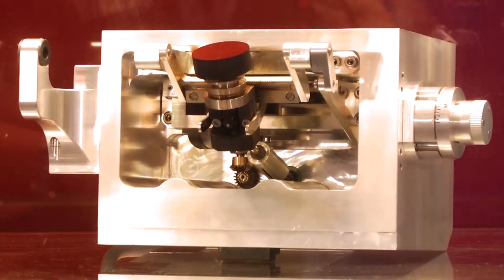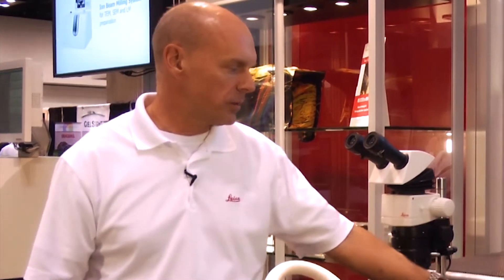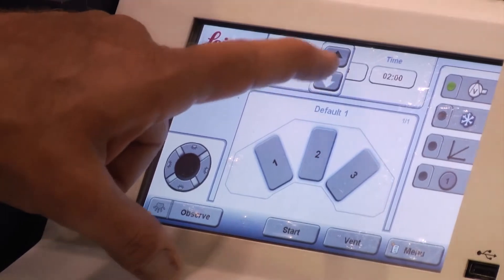The sample handling on the system is enabled especially with a high precision microscope which can be used for preparation of the sample and getting it into the system, but you can also observe the process during the actual milling. Everything is operated from a very simple touchscreen computer control — a very simple process to set the parameters at the right level, and then when everything is ready, just push start and everything takes care of itself by the computer.